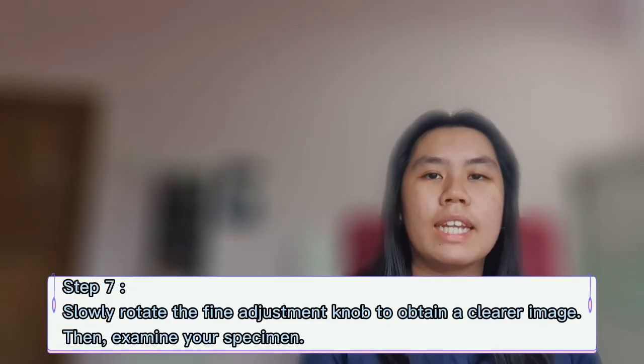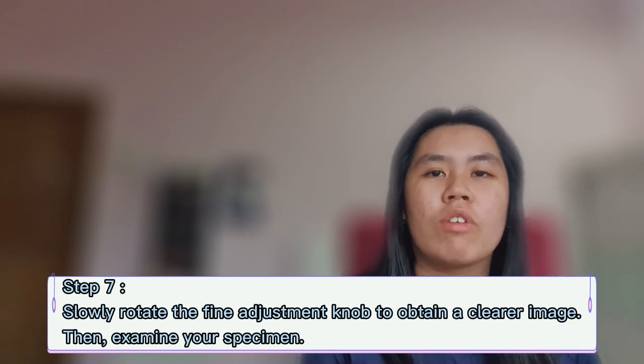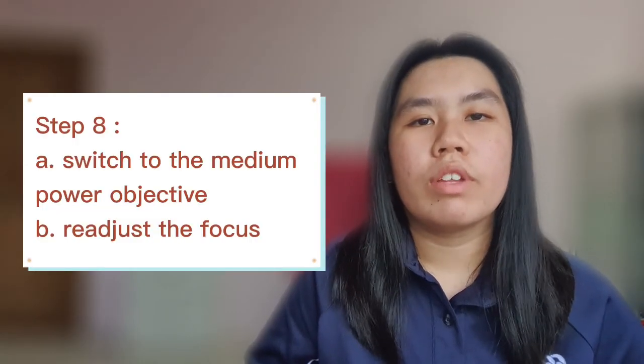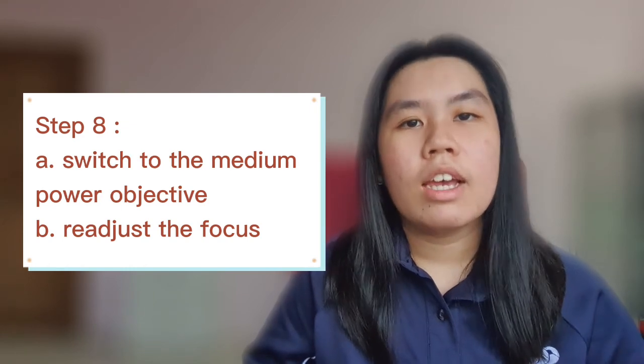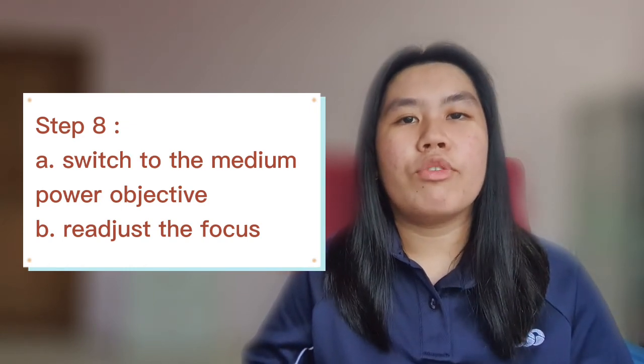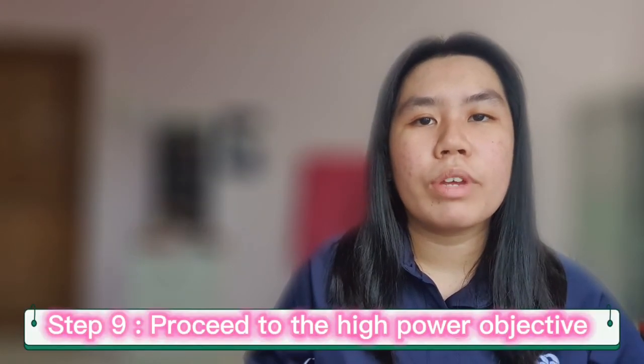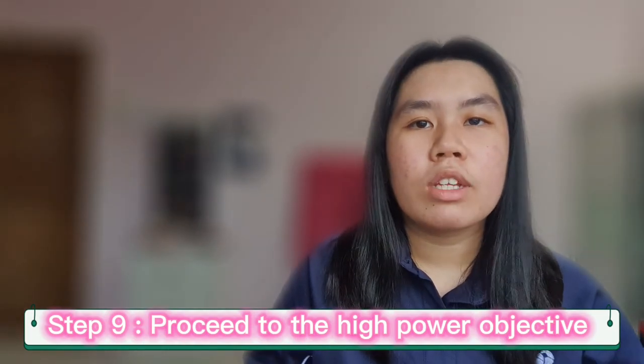Step 7. Now slowly rotate the fine adjustment knob until you get a clearer image of the specimen. Then start to examine your specimen. Step 8. After finish the viewing with the lowest objective lens, switch to the medium objective and readjust the focus with the fine adjustment knob. The last step of using a microscope is, after we have it focused, proceed to the high power.